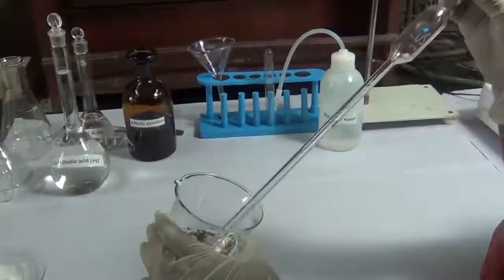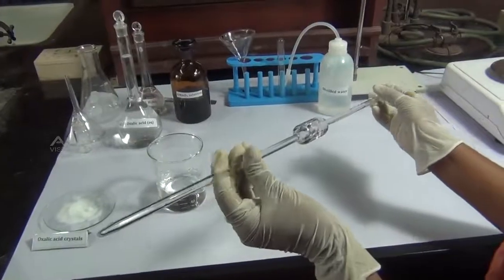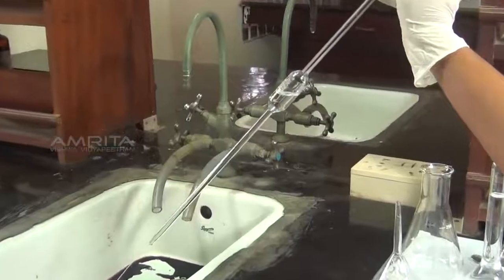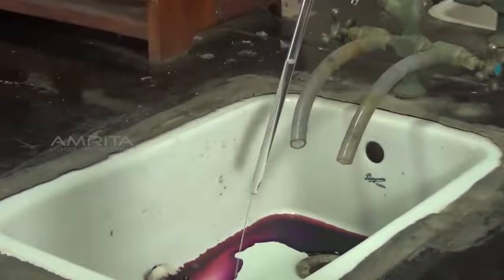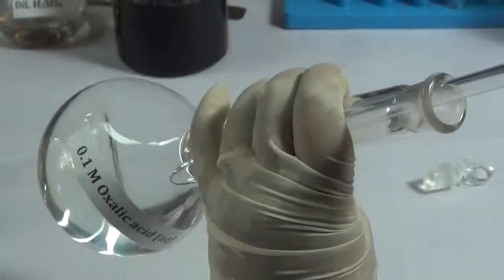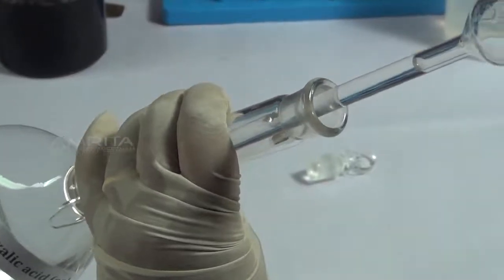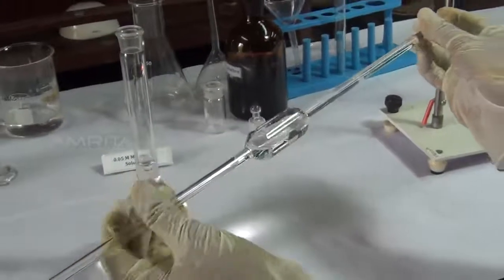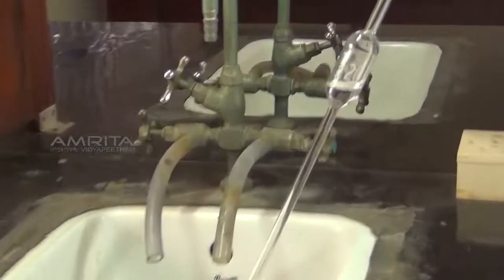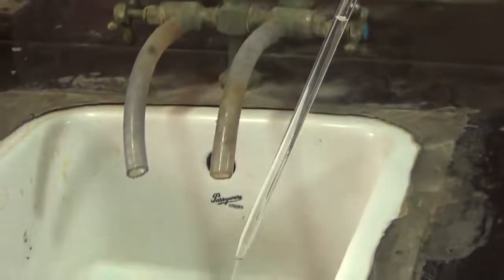Take the 20 ml pipette, pipette out a small volume of distilled water, rinse it and drain the water. Repeat this process 2 or 3 times to remove the impurities from the pipette. After rinsing with water, pipette out a small volume of oxalic acid solution, rinse the pipette and drain it. Repeat the step 2 or 3 times to remove any moisture inside the pipette.